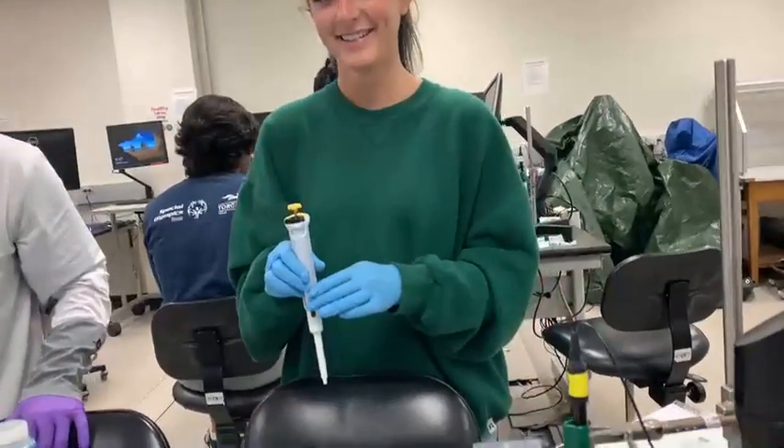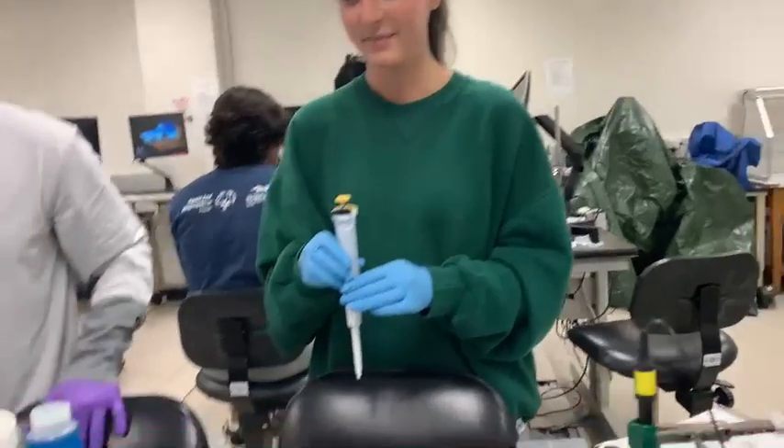Hello, I'm Nora. I'm Ria. I'm Victoriana. And today we are going to demonstrate how to use micro pipettes.